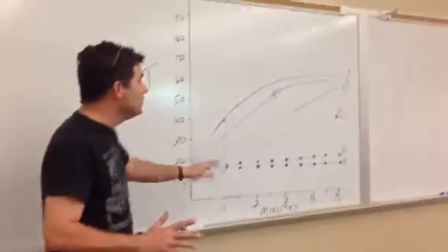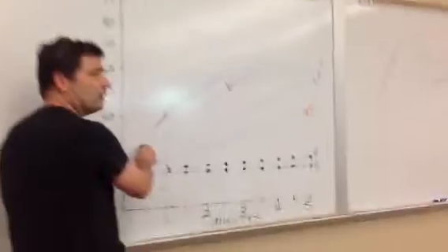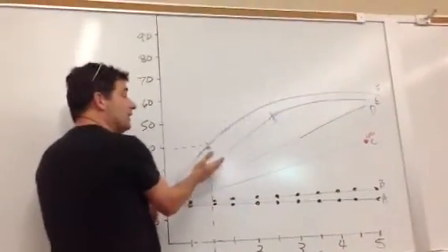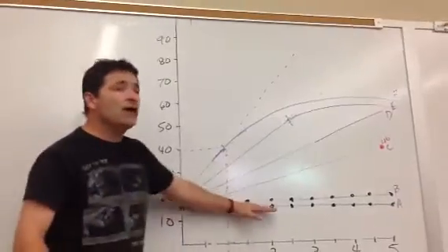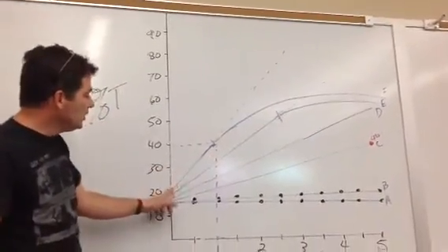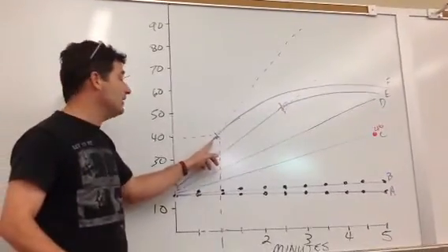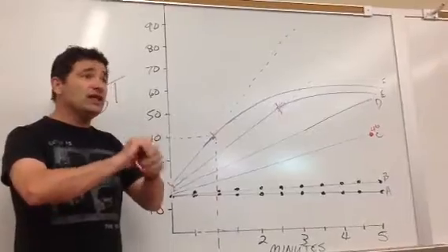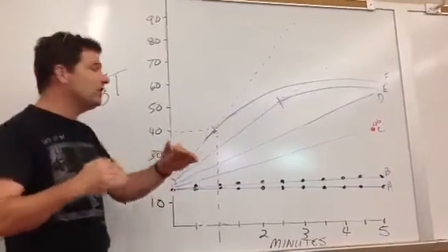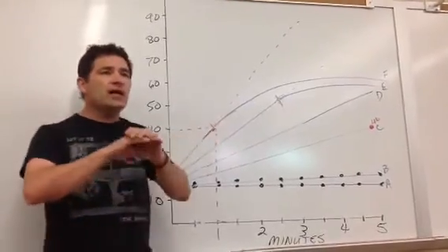Part of the line. Once we get to this point, we're limited by the amount of enzymes, right? That's why each one of these has a slightly different slope, because we're having more and more enzyme available. But as you're going along, time is moving along here. This one, which has 2% enzyme in it, those enzymes are so much of it, and it's working so fast, it's breaking down so much amylose so quickly that at this point right here, it's running out of amylose.